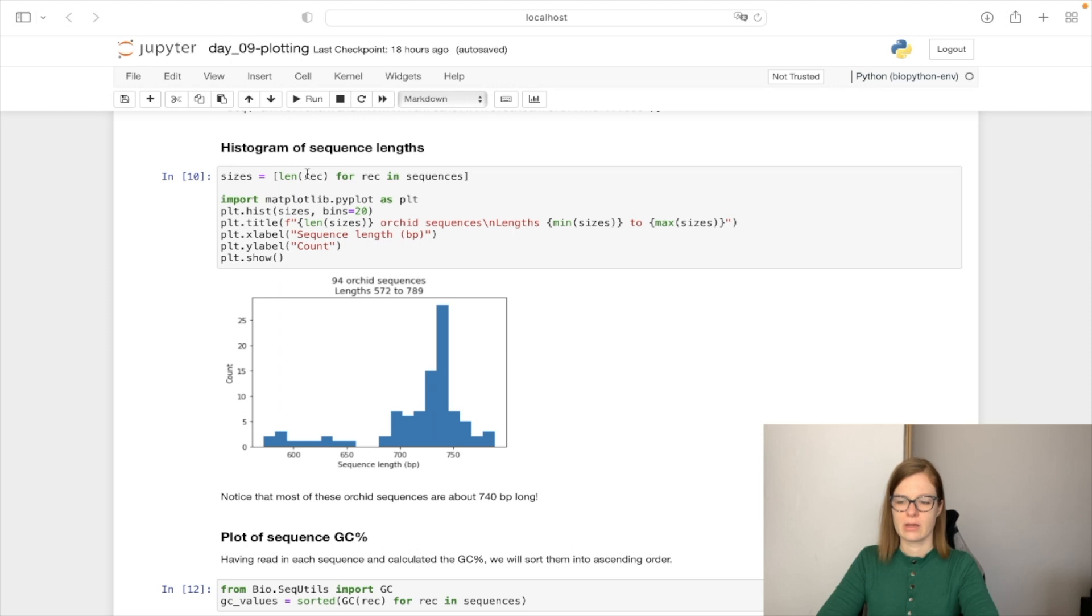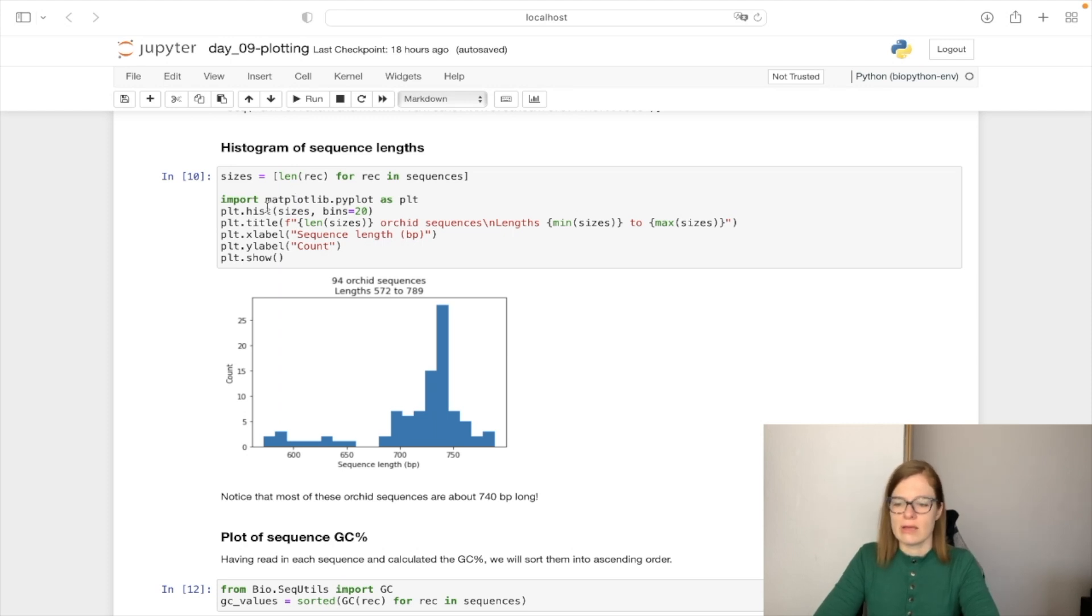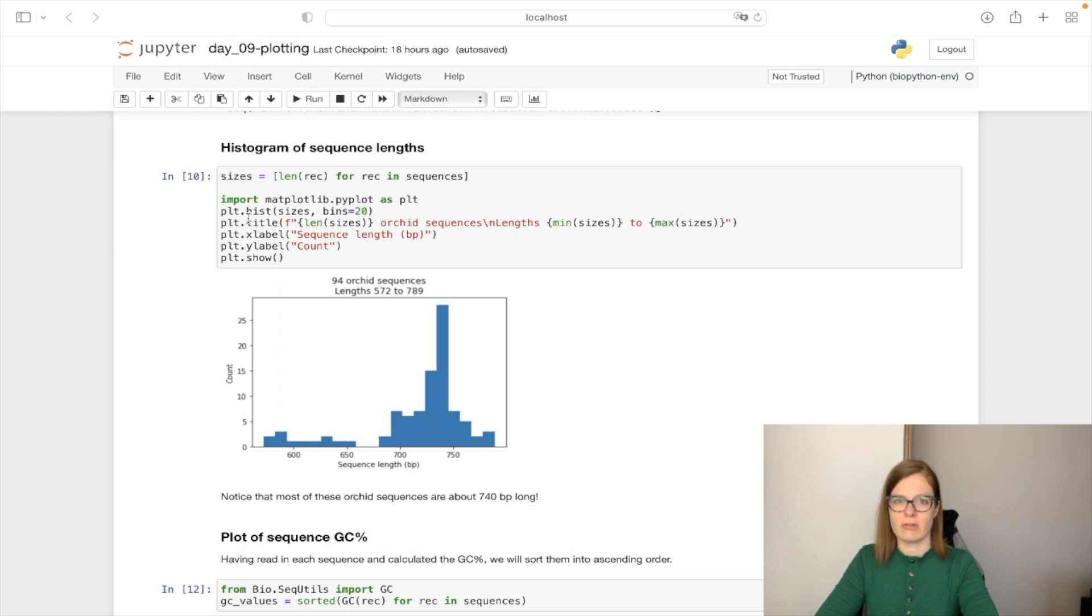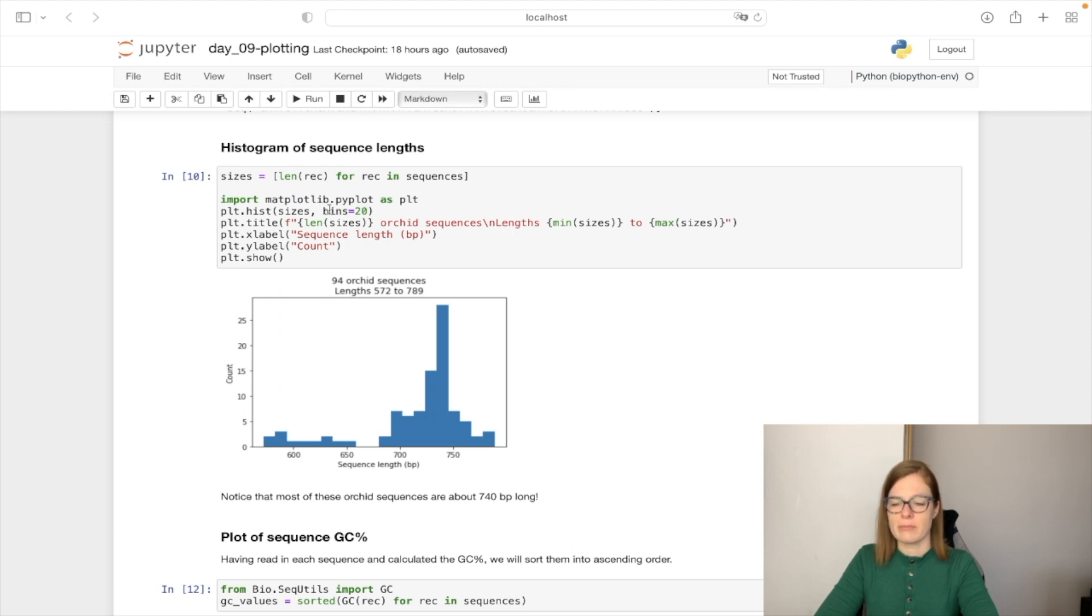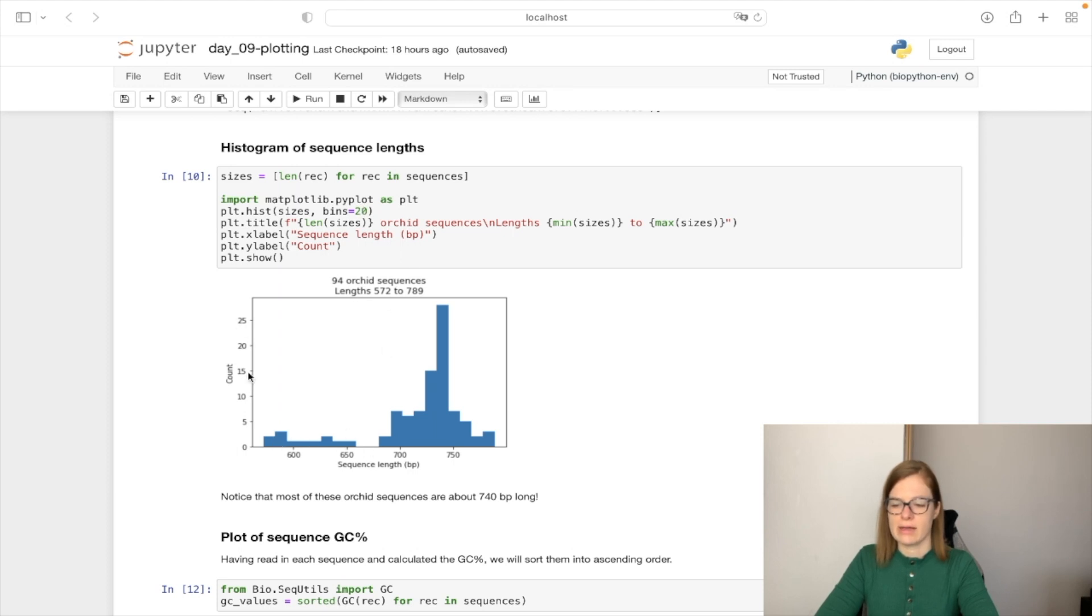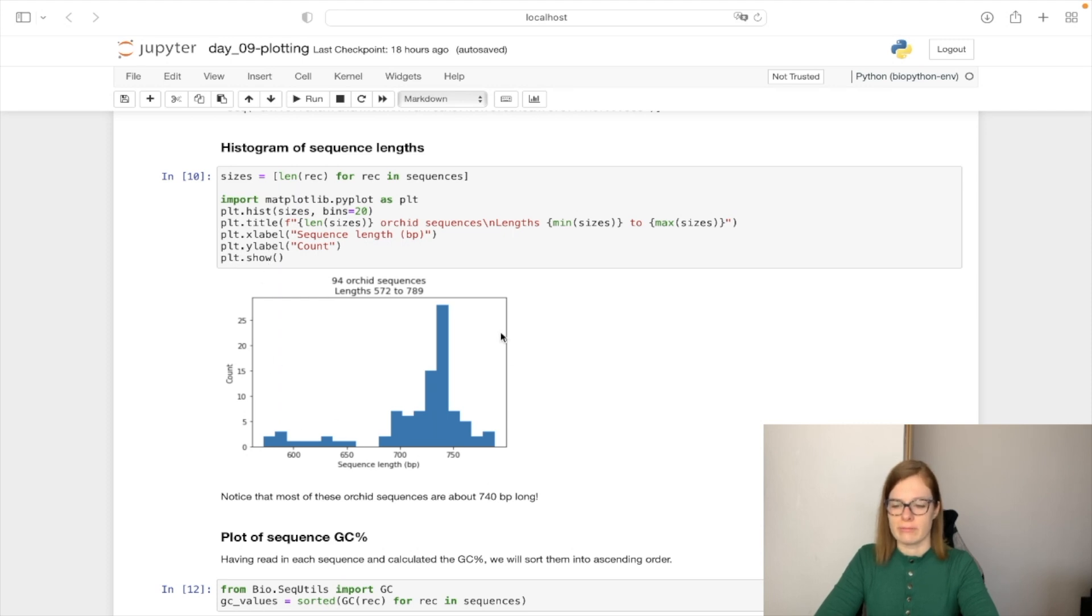When we have this information, we can plot the histogram using the matplotlib library, which is a standard library for plotting. We will plot our length in a histogram where the number of bins is going to be 20. We can set the title, the x label and y label and then we are going to execute plot.show to show our histogram.